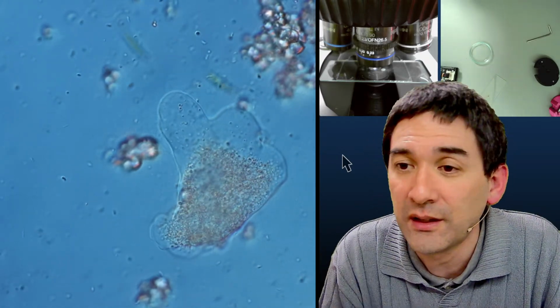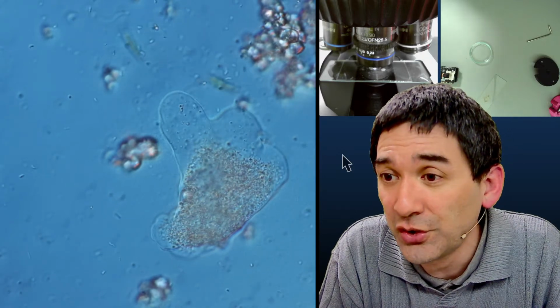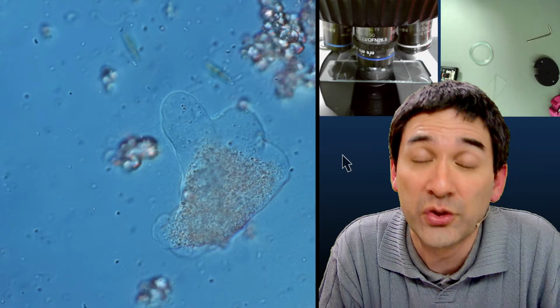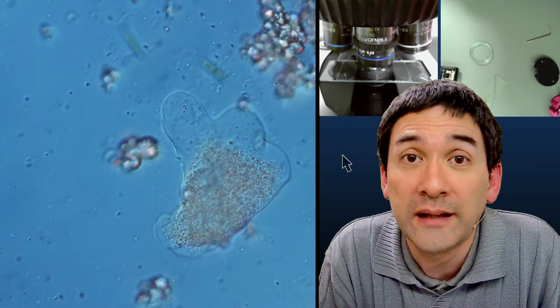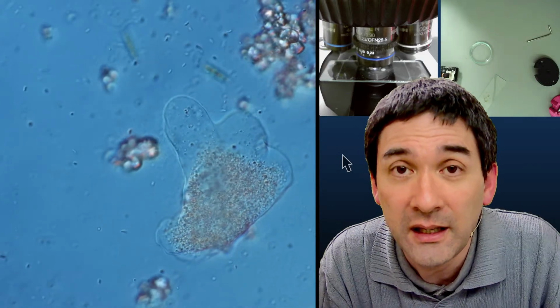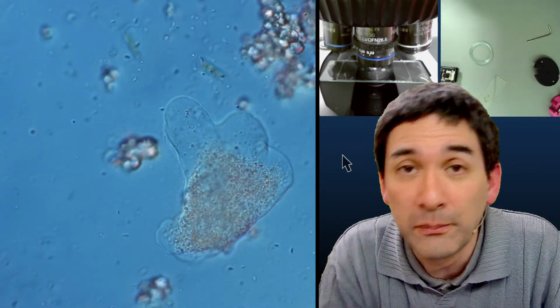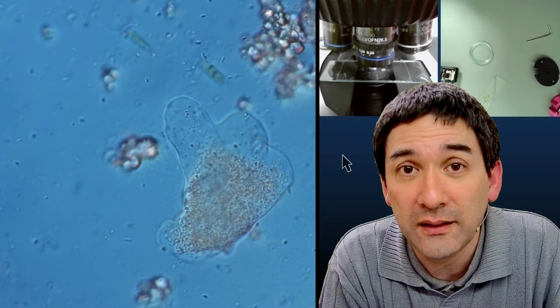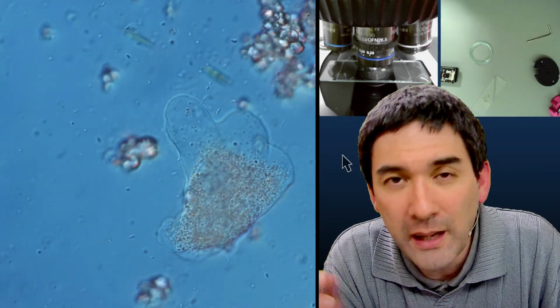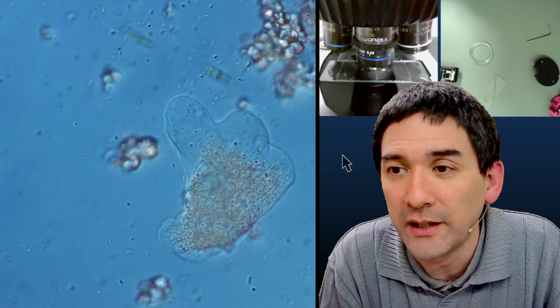What you can also try, which is a little more advanced, is a dye, a stain called Nile Red. It sticks to the microplastics, and then you can use UV light to make it shine. It might be possible to use a UV flashlight for that.